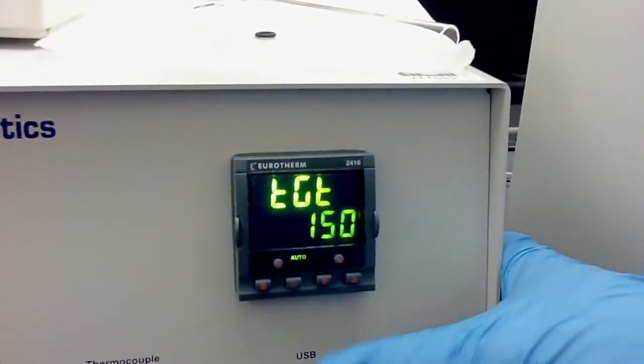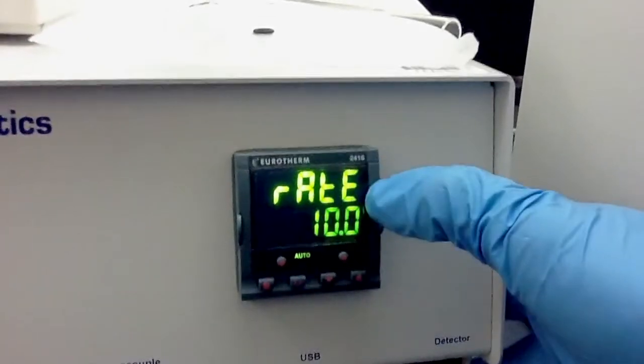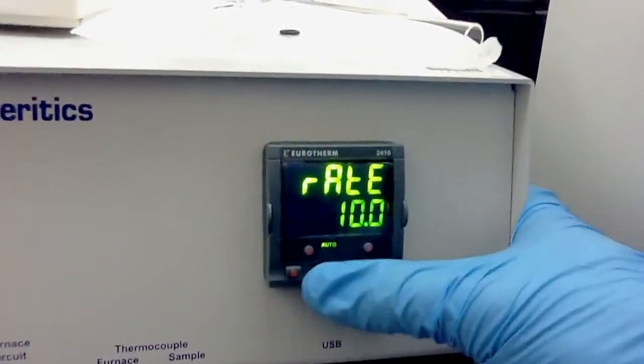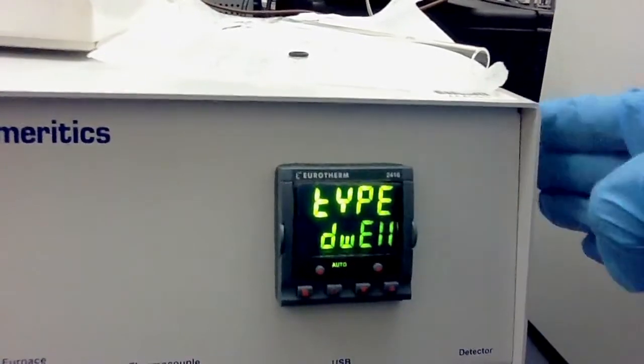So we set this one here and press this circle once again to enter. The next one is ramp rate, how fast it will heat the sample. So it's like 10 degrees. The unit is 10 degrees per minute. And segment 2, it will stay on the temperature.